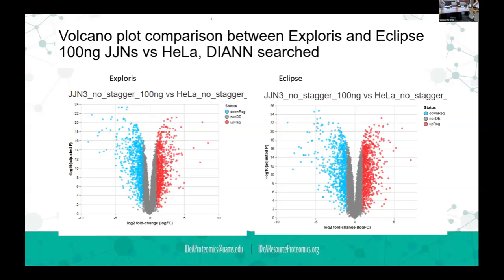Yeah, I was going to say the same. We did an experiment similar to what you did, with different samples, between the timsTOF, the HT and the 480, and when you set standard things like you did here, we saw the same thing. Maybe like 20% overlap, and then you're like, man, which instrument do I use? What do I trust? We did the exact same thing.